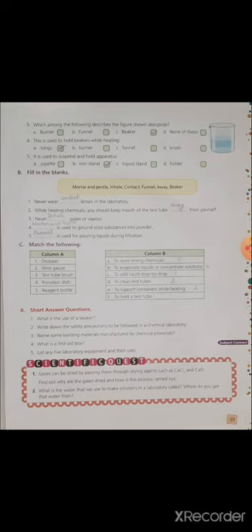Now match the following. Column A. First one is given dropper. Dropper is to add liquid drop by drop. Second, wire gauze. It is used to support containers while heating. Test tube brush to clean test tubes. Fourth, porcelain dish to evaporate liquids or concentrate solution. Fifth, reagent bottles to store strong chemicals.